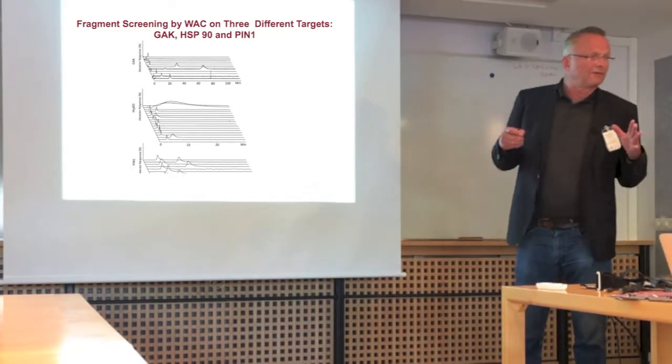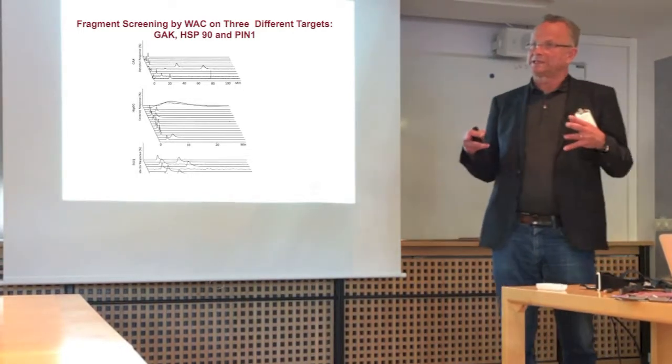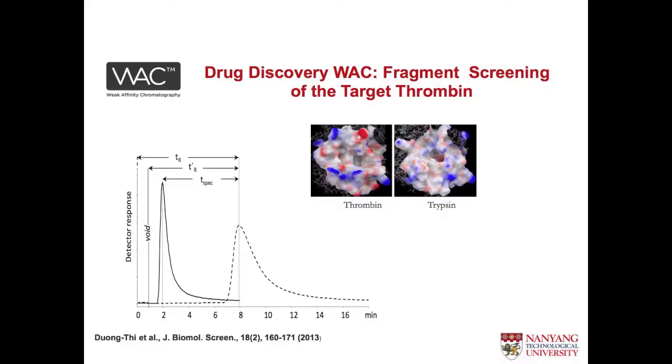So that's powerful. We have worked with up to near 100 fragments in one mixture. So you think about it, we can run a whole library in a short time. I'm going to show you a slide on that later. Here's the case we did with thrombin, and again we have the retention times, and in this case we were lucky to have a blocked column, so we can actually work with that.